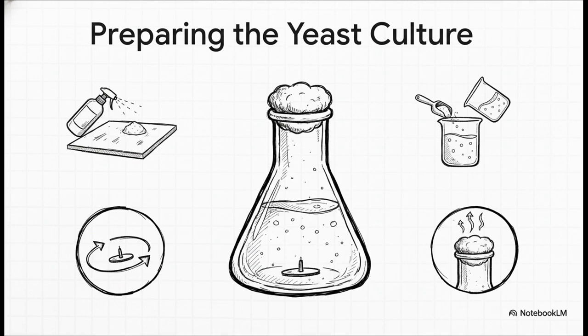Let's talk prep work. First things first, cleanliness is absolutely critical. We disinfect everything to make sure the only thing growing in our flask is our yeast. Then, we mix our yeast into the glucose solution.